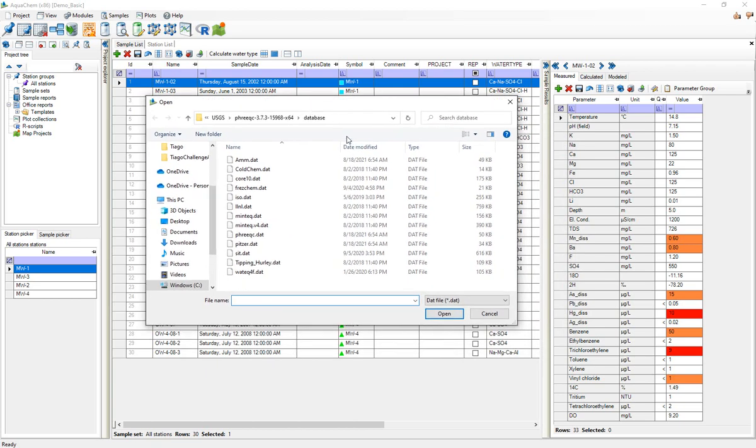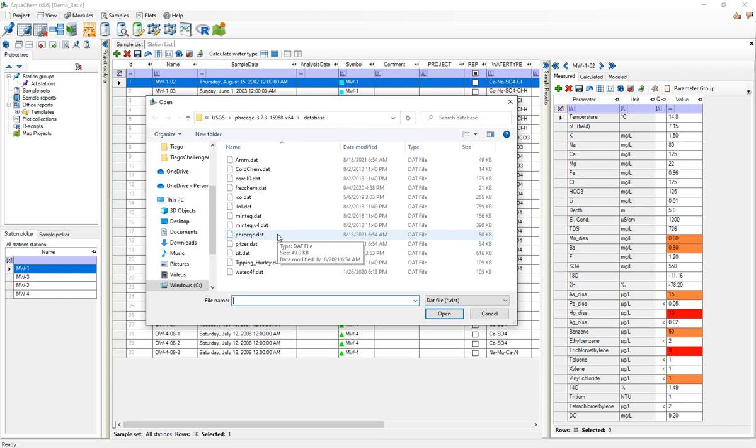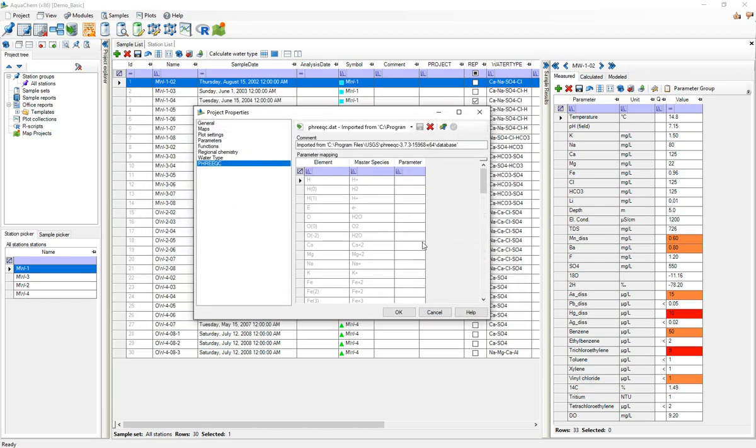Now by default PHREEQC installs with about a dozen different databases. The actual considerations for which database you'd want to use again are beyond the scope of this video, but there are resources, for example the PHREEQC documentation or even papers discussing some considerations that exist for selecting which one of these databases to use when modeling with PHREEQC. At any rate for this project I'm just going to select PHREEQC.dat and hit open.